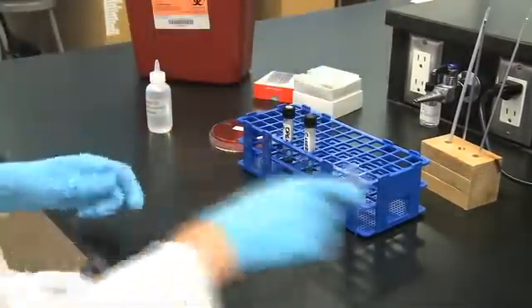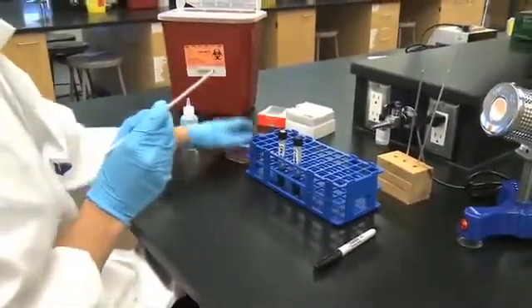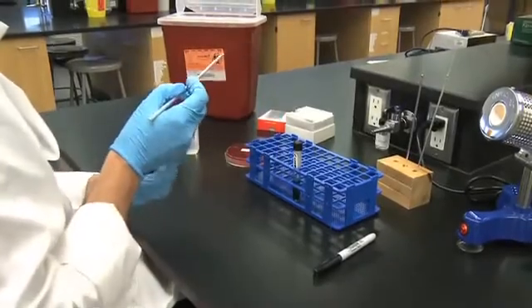Lightly inoculate the tubes to within a quarter inch from the bottom by stabbing the medium with an inoculating wire.